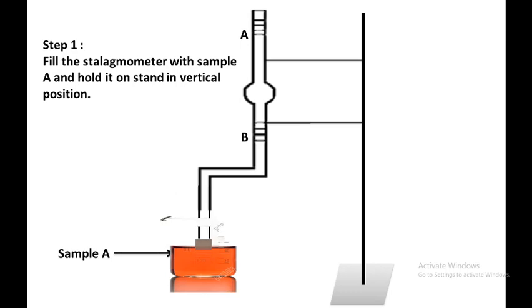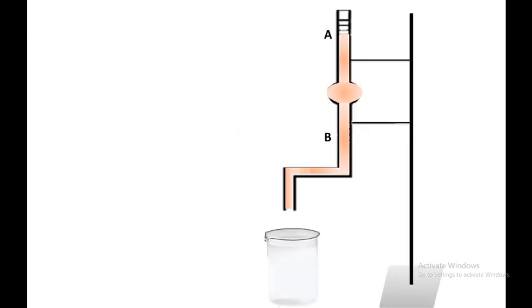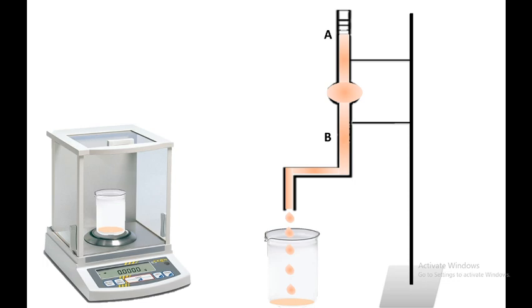Again clean and dry the stalagmometer and mount it on the stand in a perfectly vertical position. Then suck the sample under test — sample A — up to mark A using a pipette sucker. Hold the liquid using your thumb, then release. Collect the same number of drops — 20 drops of sample A — in another clean and dry glass beaker. Take the weight of these 20 drops; it is showing 25.287 grams.